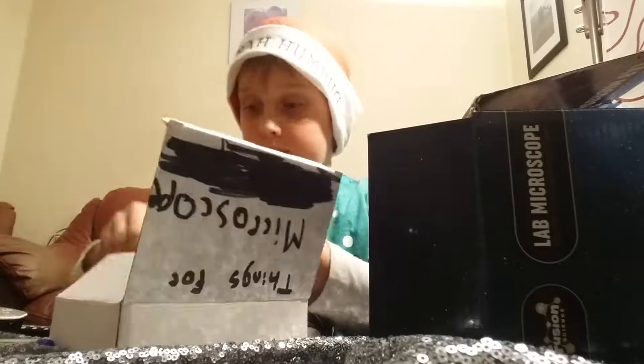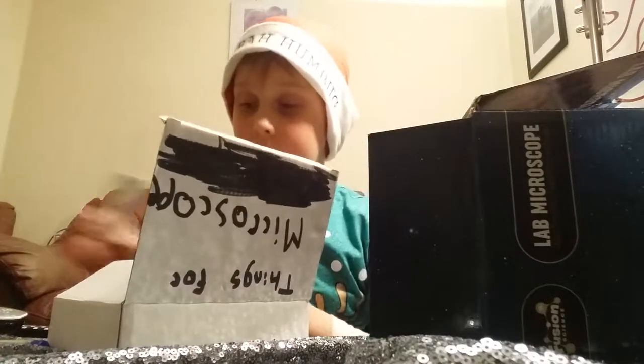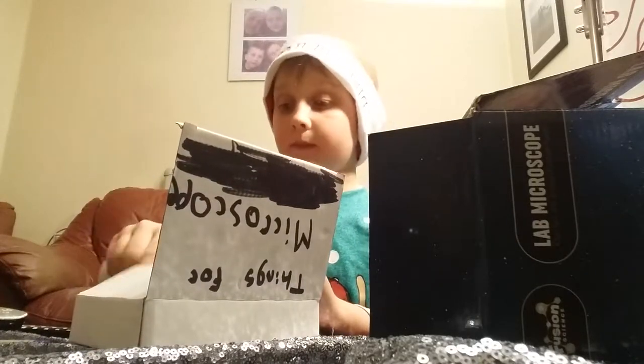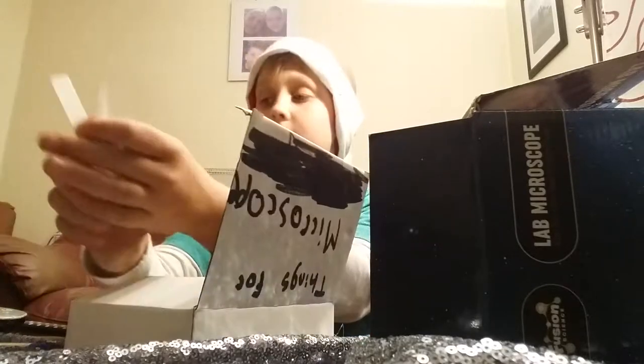There are these two — if you want to see what different stuff looks like, I'm going to be using these first. There are eight different things. There's a grabber. There are about five of these — the covers.